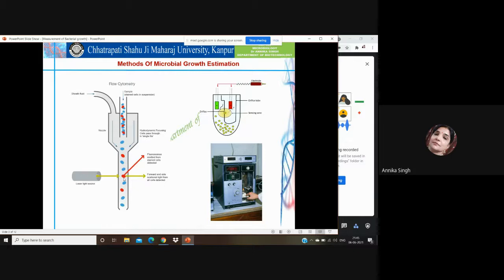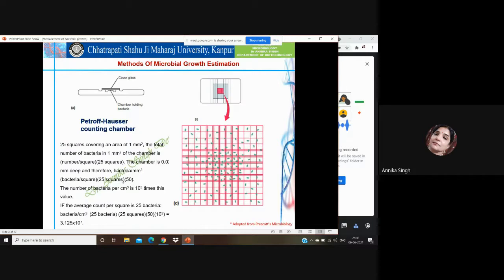As we know, the cells are separated in space because there is not enough space to pass more than one cell, so only one cell can pass through at a time, and each light scattering event is detected independently.